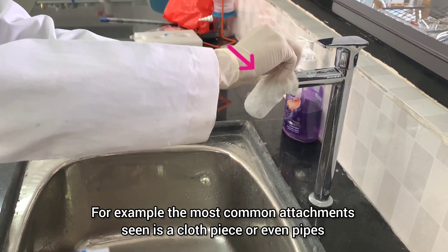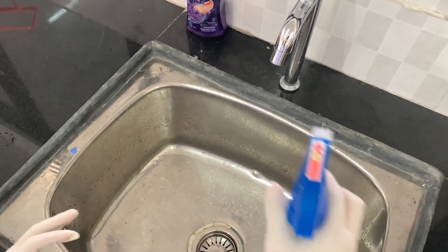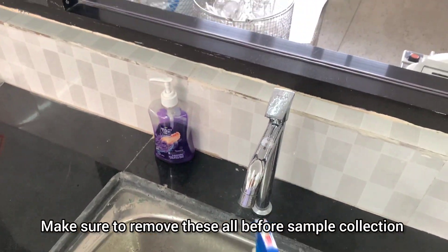For example, the most common attachments seen are a cloth piece or even pipes. Make sure to remove all of these before sample collection.